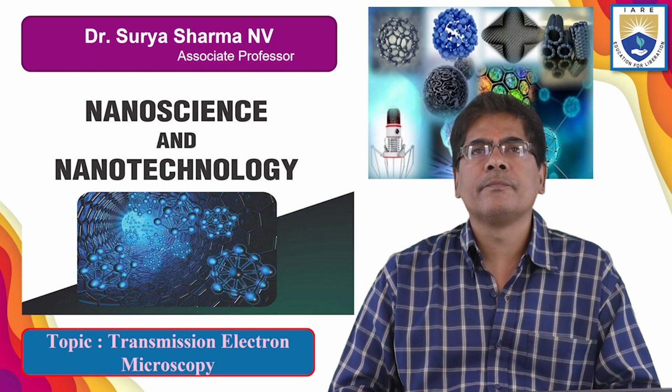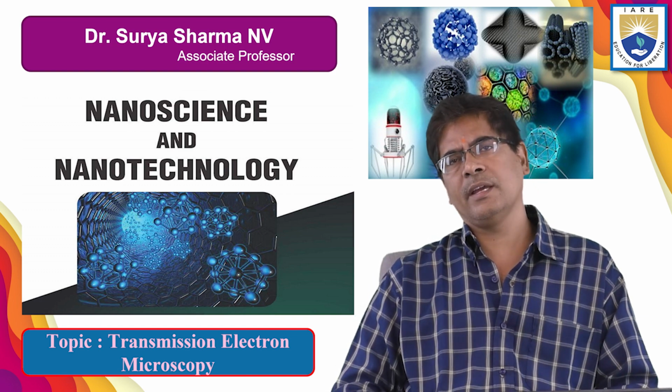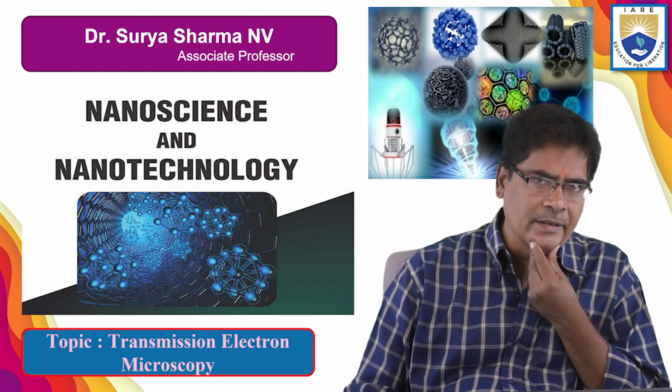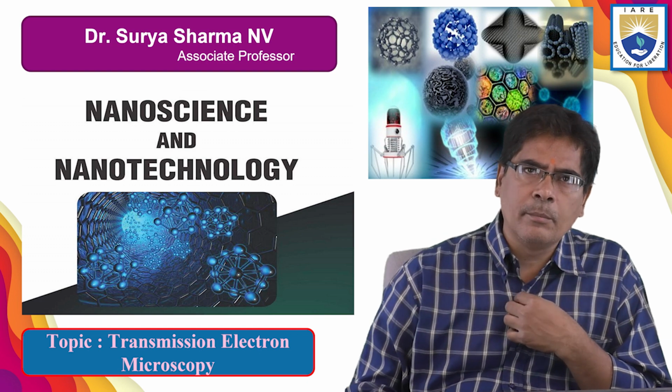So in today's lecture, we will see the characterization techniques. Till today, we had seen different characterization techniques like X-ray diffraction technique and scanning electron microscopy. In today's lecture, we will see what is transmission electron microscopy.